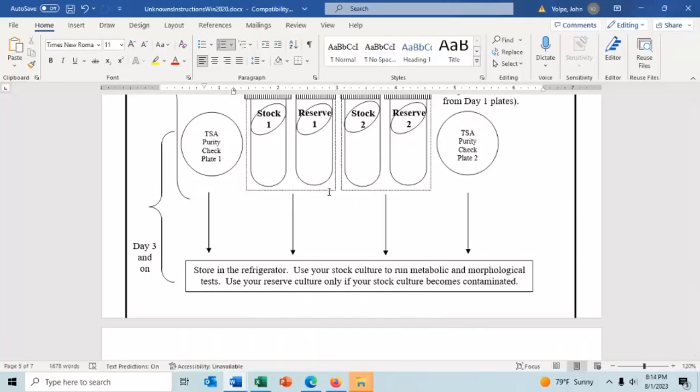However, you can go through the motion of splitting, growing your cells into separate isolated colonies, taking from an isolated colony, streaking it out to get a second isolated colony, and then taking the cells from that second isolated colony to set up your pure culture. You can go through that, and actually you can write that up, that you did that in your lab report. Okay. That isn't required, but you can do that.